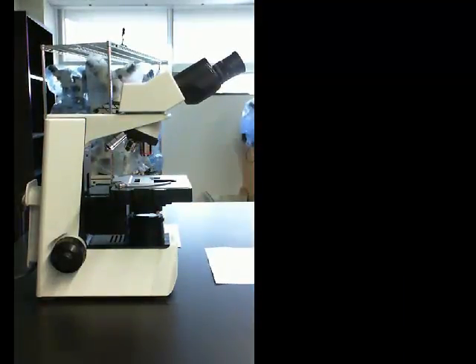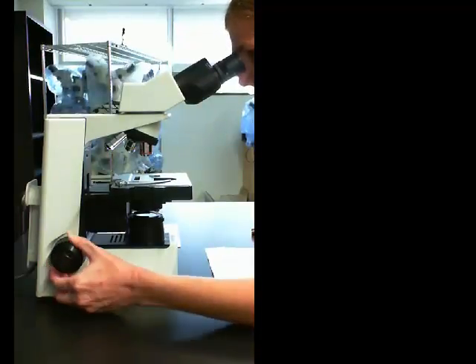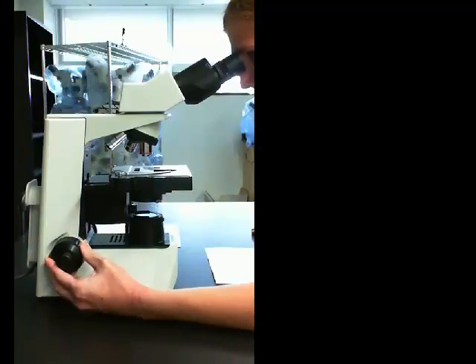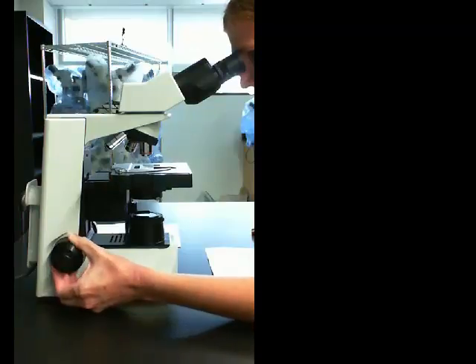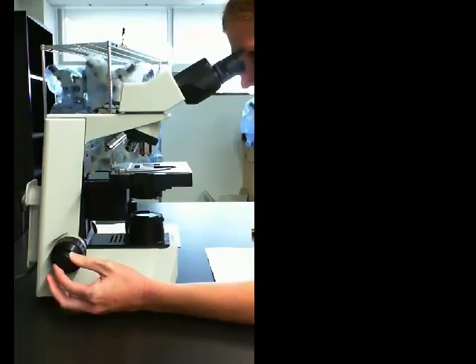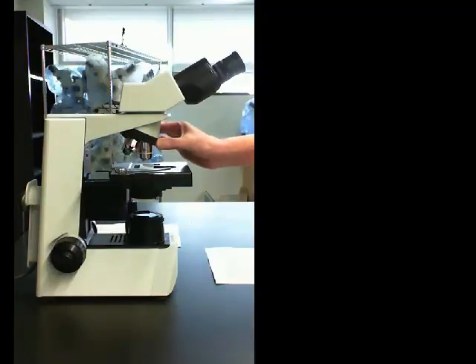I'm going to begin focusing with this lowest or scanning power objective lens in position and change to the higher power lens when necessary. I'm going to start by focusing with the coarse adjustment knob and then fine tune with the fine adjustment knob to perfect my focus. I'm slowly bringing the stage up as I focus, and my image will pop into view and into focus. And then I can adjust with the fine adjustment knob. Okay. We can then move to higher power objectives, which should remain in focus as we slide from one objective to the next.